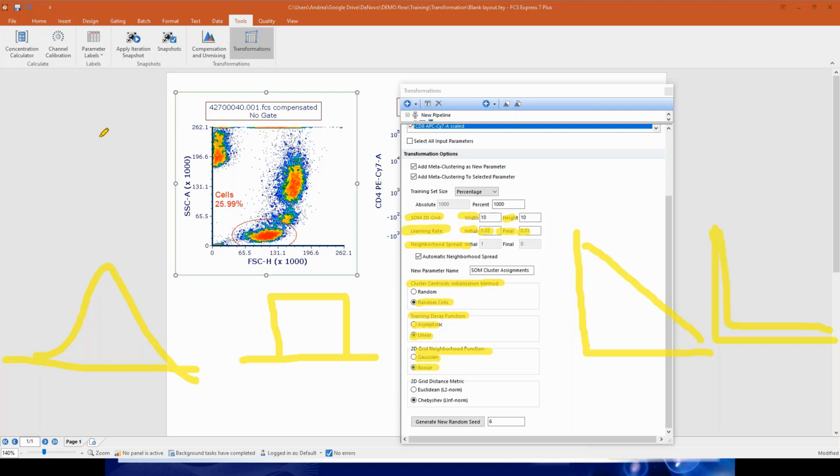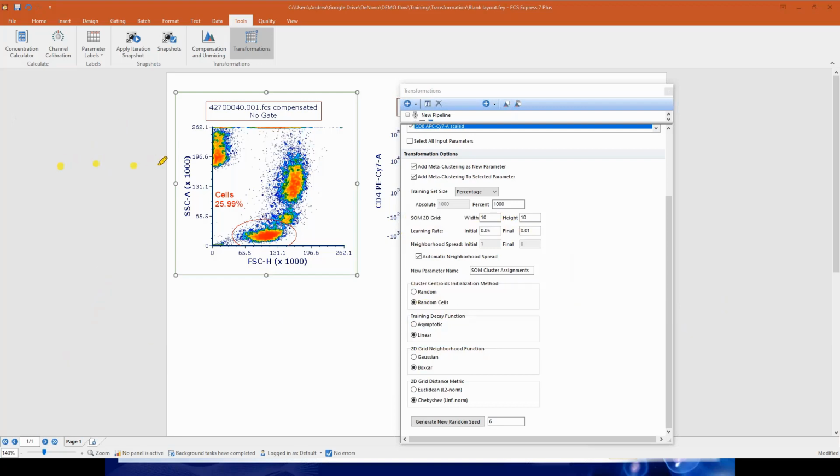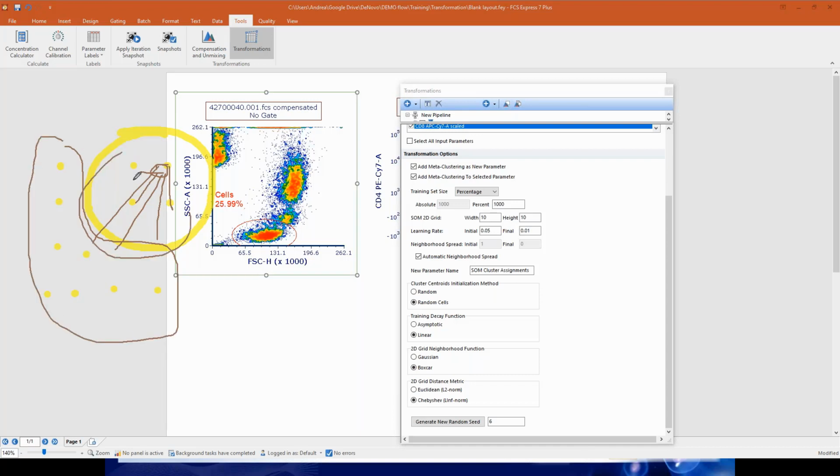Then you might remember that when you need to deal with the neighborhood function, you always need to define the neighborhood spread. If you remember, this was our matrix, and the neighborhood spread was sort of a halo, either well-defined or a shade. But then how to compare each node with this halo? You need to define the distance. If this is the winner node, you need to define the distance between all the other nodes and define whether some are out and some are in.